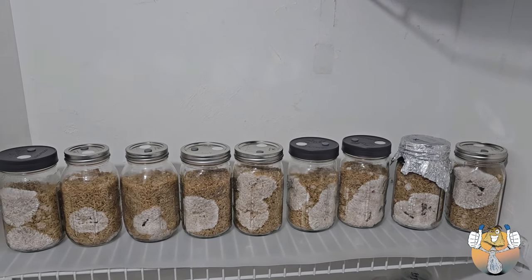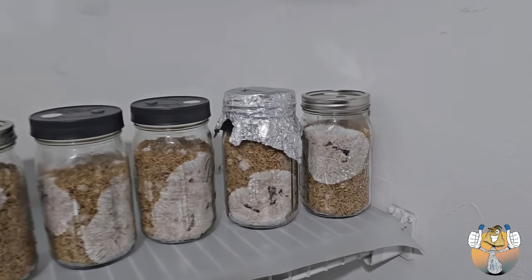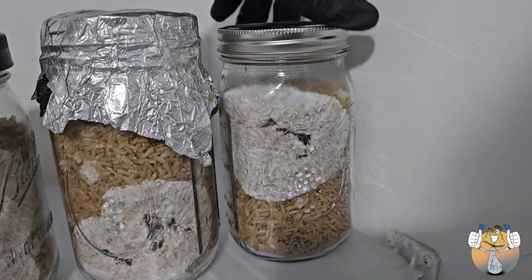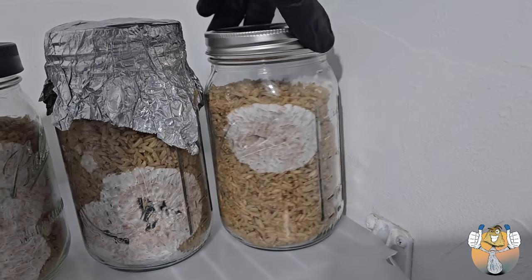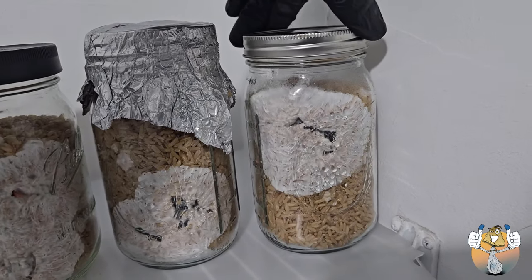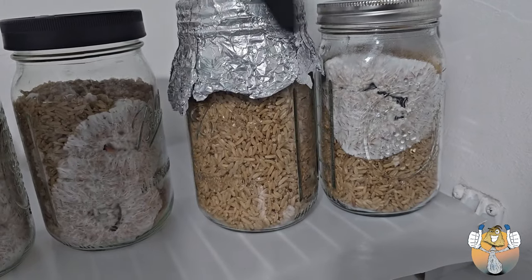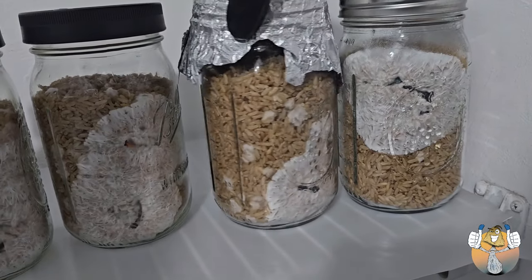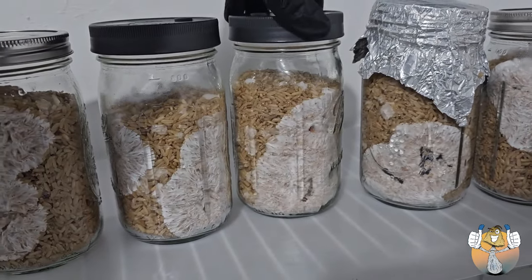Yes, yes, let's go, baby. We are 9 for 9. Let's go. That's crazy. I wouldn't think that 8 days in we would have this much mycelial growth out of this brown rice. But it's doing very, very well.